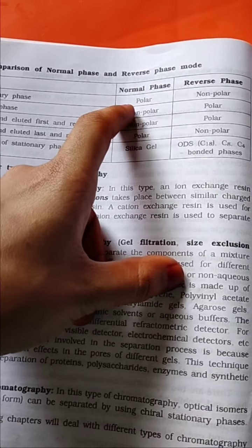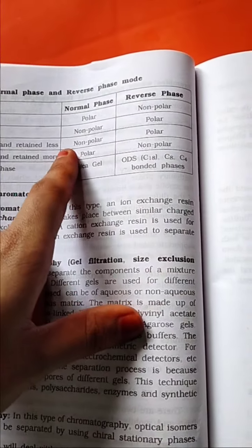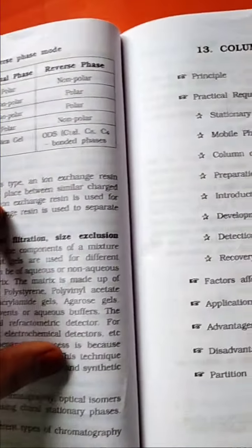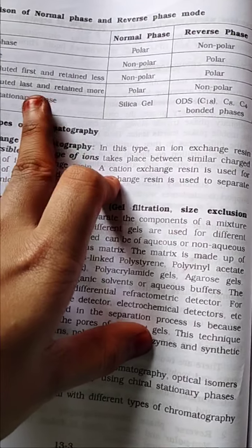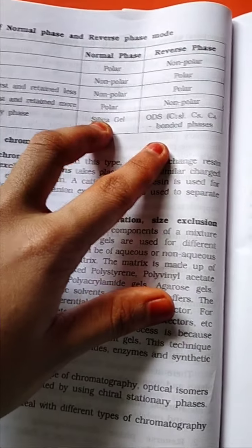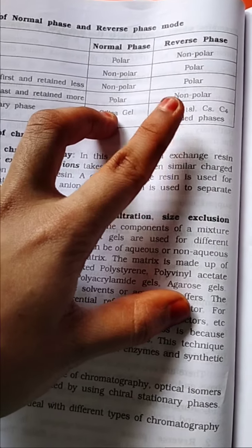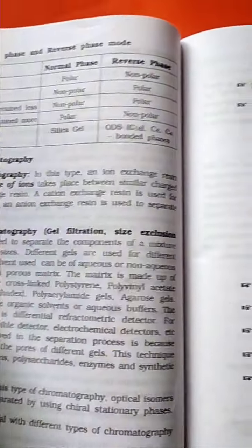The two are opposite. Examples of stationary phase: in normal phase it is silica gel, and in reverse phase we use ODS bonded phases.